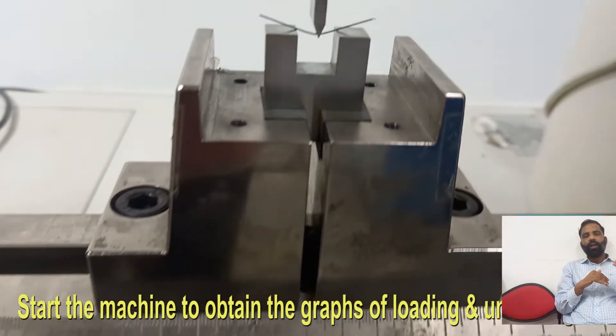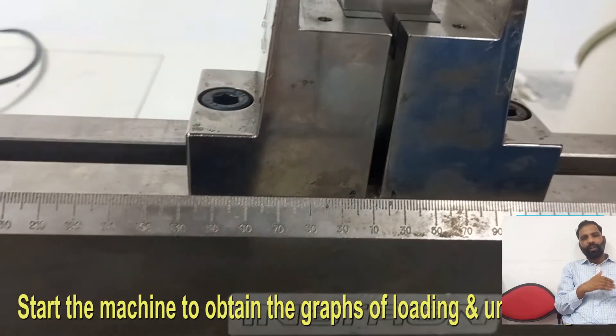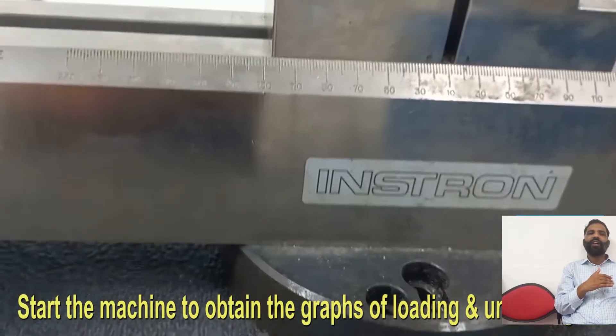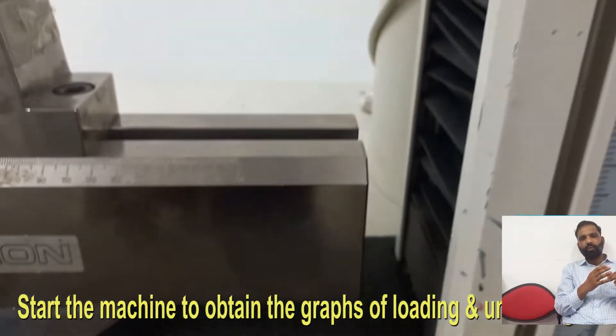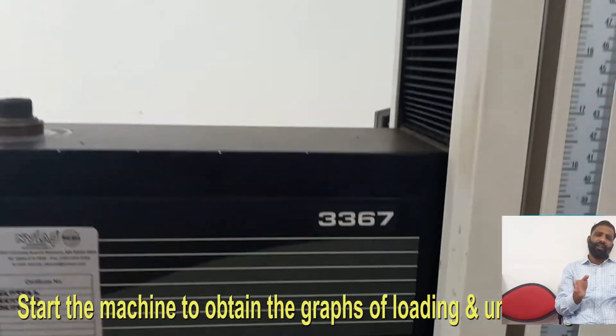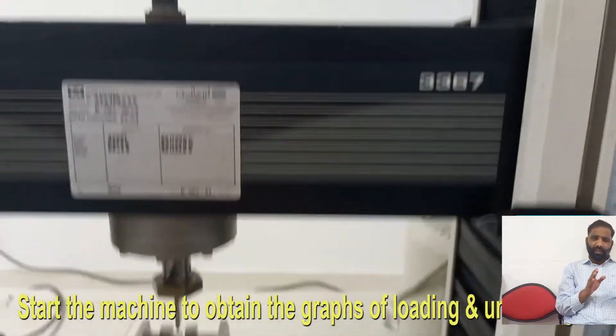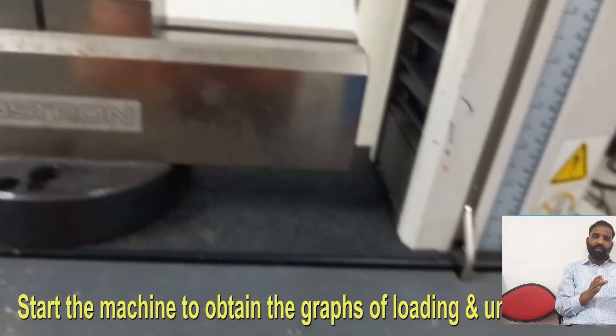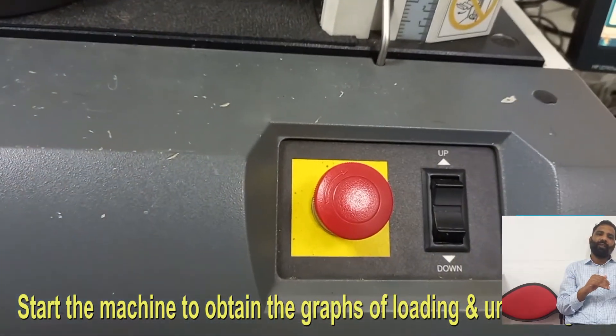According to ISO standard we can perform three-point bending at different deflections from 0.5 mm to 3.1 mm deflection. Normally for the biomechanical properties you can use 3.1.